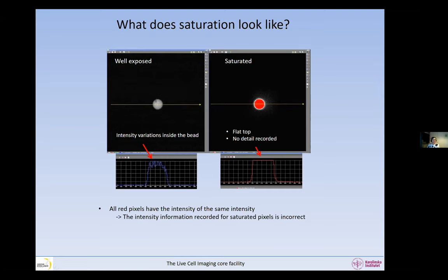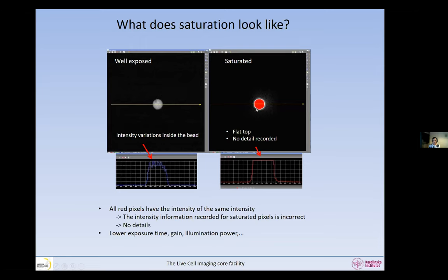The intensity information recorded in these pixels is absolutely incorrect. There are no details at all. What we need to do is lower the exposure time, lower the gain, lower the illumination power — do anything we can so that we do not saturate.